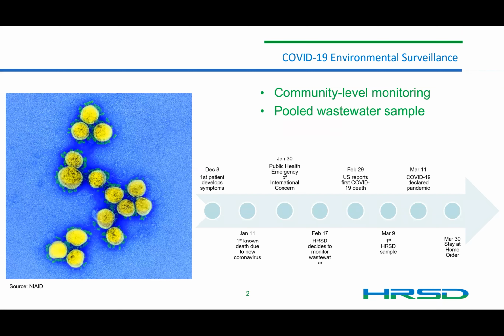This talk is really focused on our methods and our workflow and how we optimize assays as they come into the lab, specifically for community level monitoring on pooled wastewater samples. We took our first samples and analyzed those samples in early March.